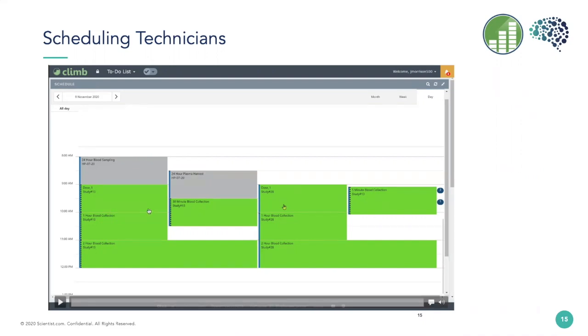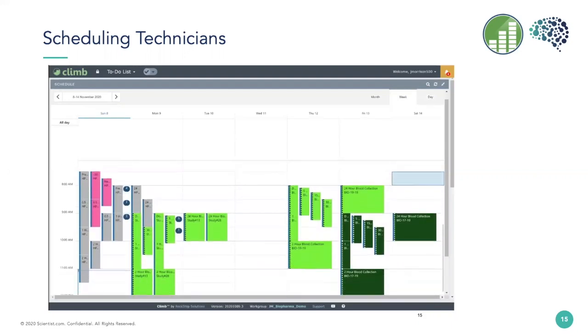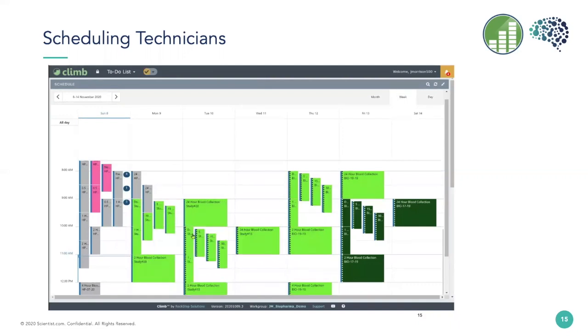We can actually look at a weekly view of this on the calendar in a database. And when we look at the weekly view, we're going to be able to see that we have some free time on a Tuesday. So we can actually take that dosing task. You can see both of those right on the left-hand side, side by side. We can take one of the dosing tasks and move it to a completely different day. And this is the anchor. So everything around that dose will actually move the entire study. Now, Harry can execute both studies on 2 different days, and we even scheduled it so his 24-hour time point from study 1 is not going to interfere with his dosing and time points on study 2.